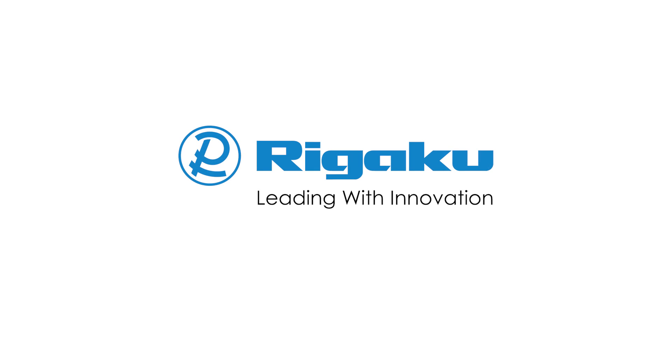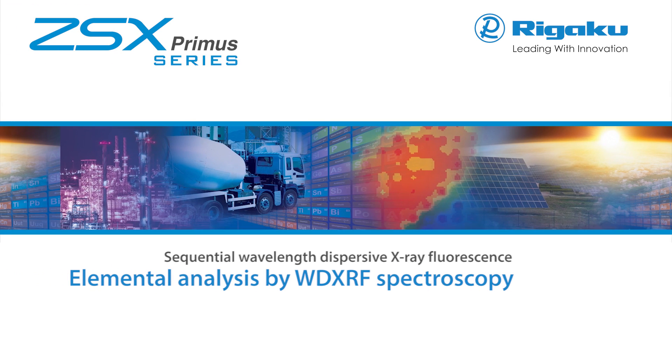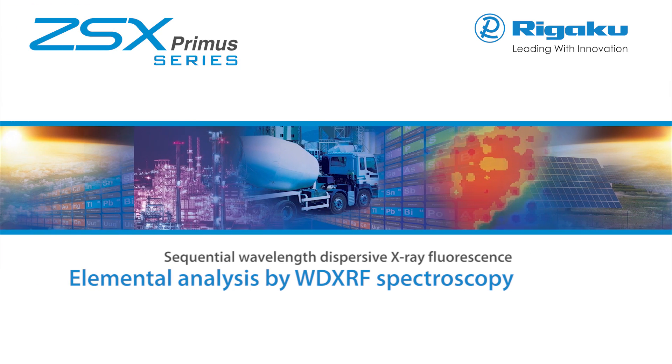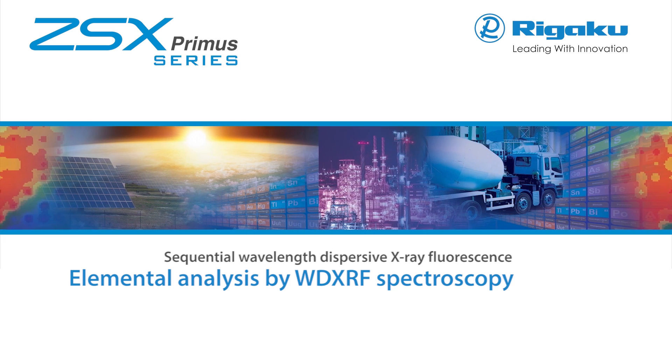Rigaku, the world's leading analytical X-ray instruments company, offers state-of-the-art solutions for your elemental analysis needs with the ZSX Primus series of sequential wavelength dispersive X-ray fluorescent spectrometers.